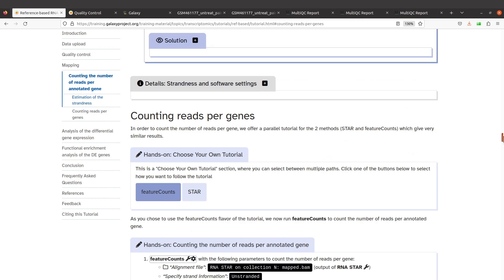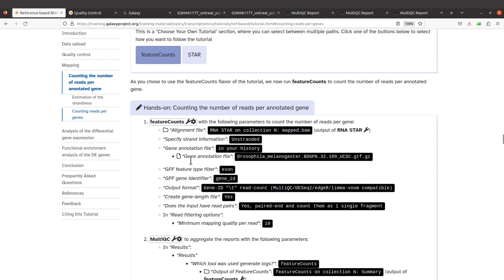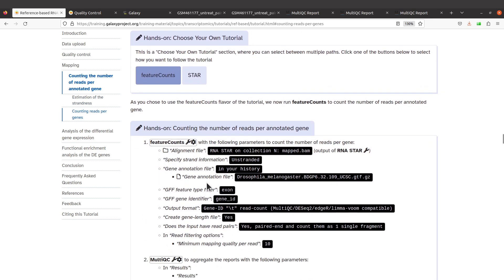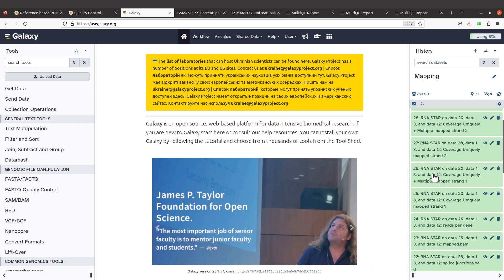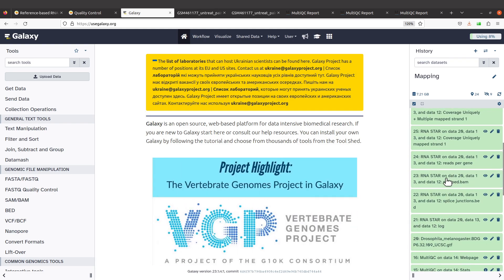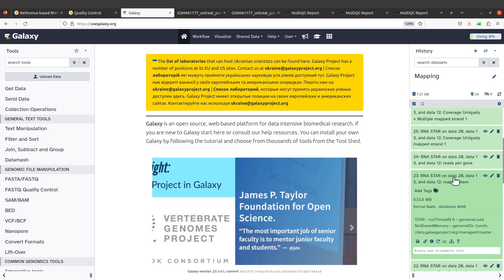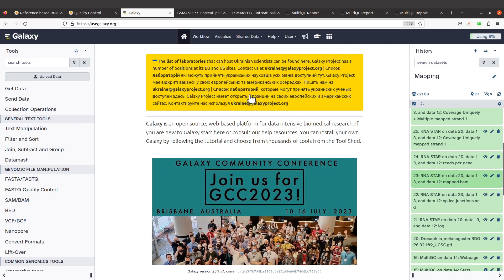Let's go down to the feature counts section. So we have the feature counts instructions here and we are going to follow the instructions to count the reads. Let's get back to the Galaxy platform. I'll remind you to try to generate this data by watching the tutorial on mapping. We are using the BAM file here — this is what we are going to use. Let's call up feature counts.